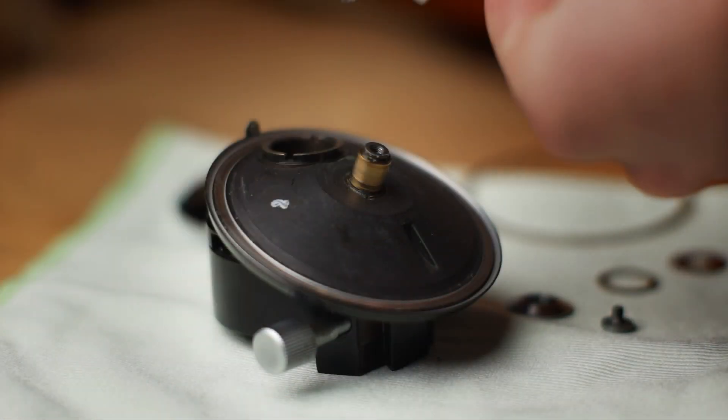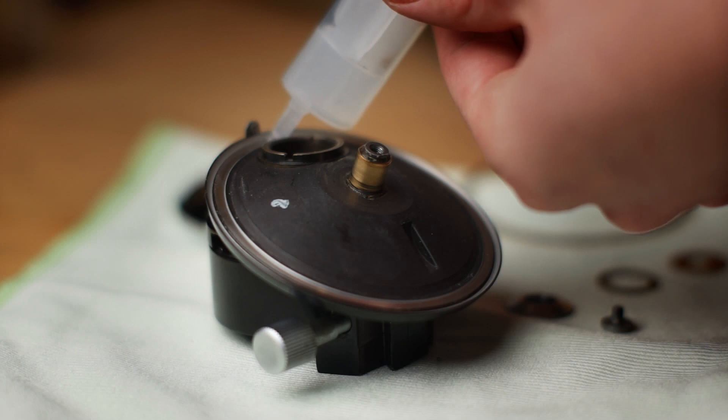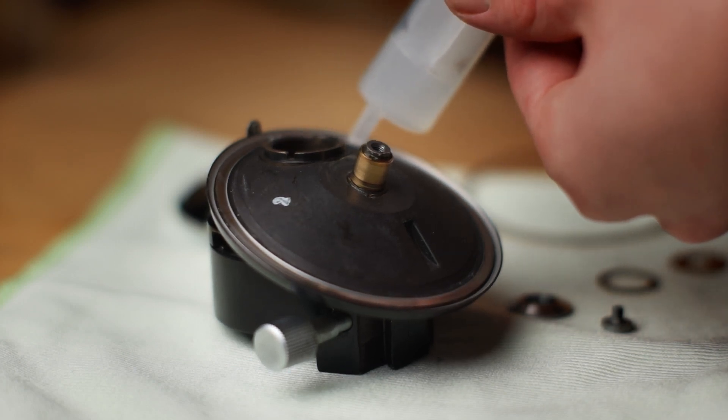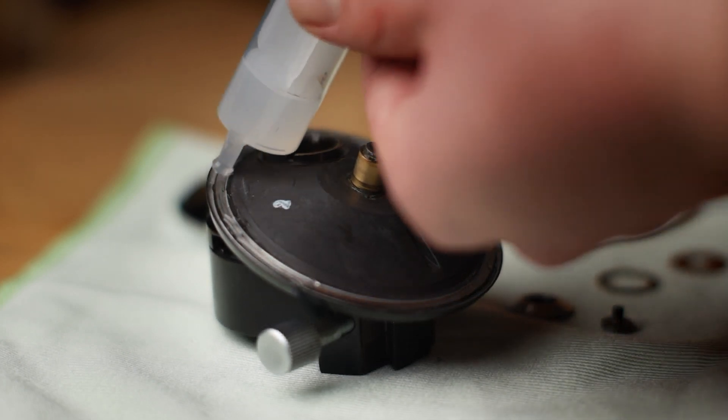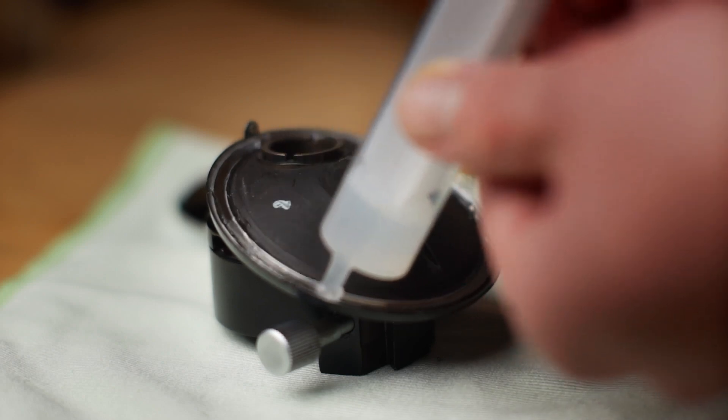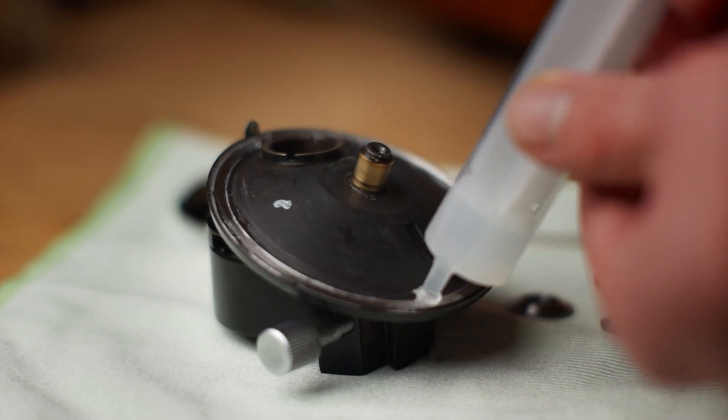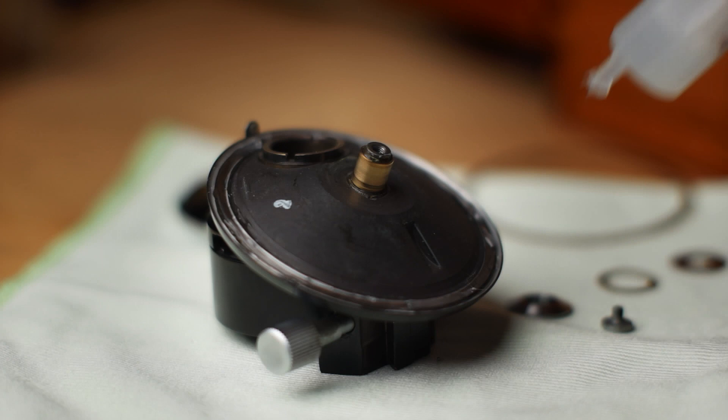Once all bearing parts were cleaned and degreased, I applied silicone grease to the lower race of the lower bearing. Note that using silicone grease is not recommended, as it dampens the movement too much. I later changed the grease to oil.